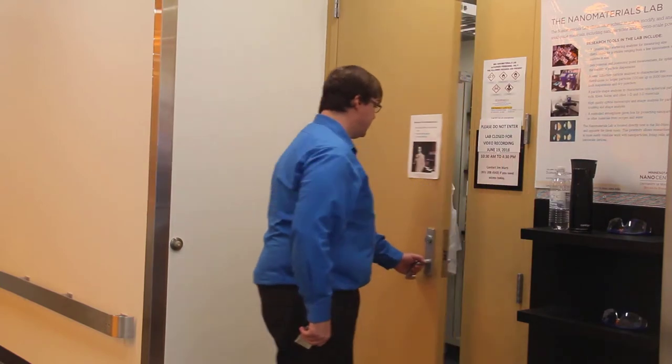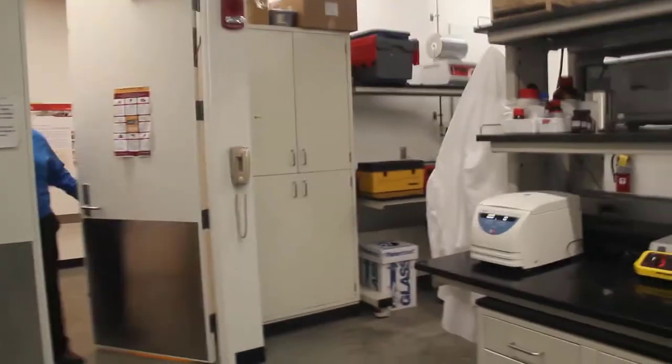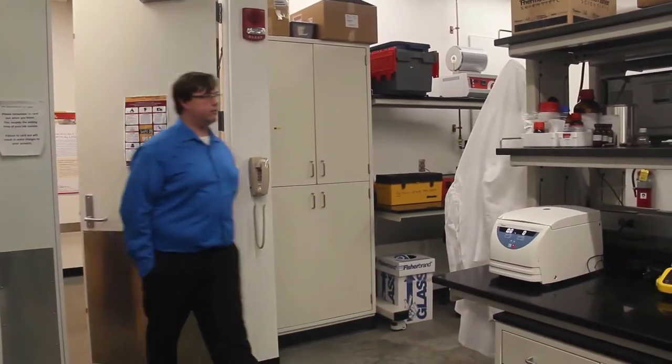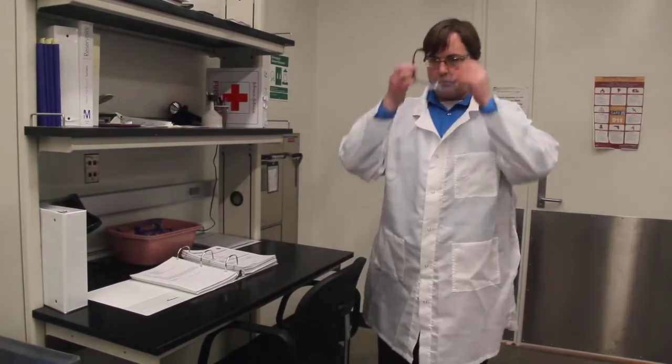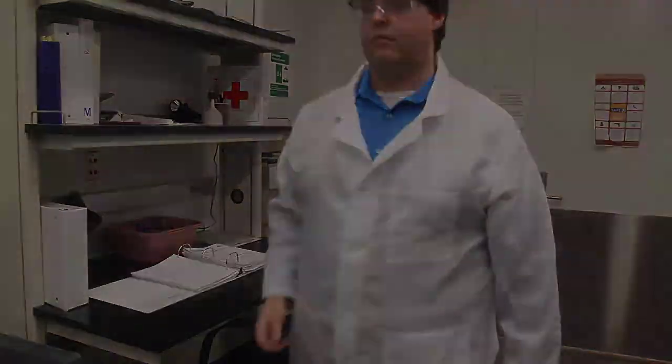Meet Matt, a student at the nanofabrication lab. Matt handles chemicals used to create nanomaterials. Handling these materials requires knowledge about the emergencies that can occur. So Matt's here to demonstrate the emergency equipment in the nanofabrication lab.